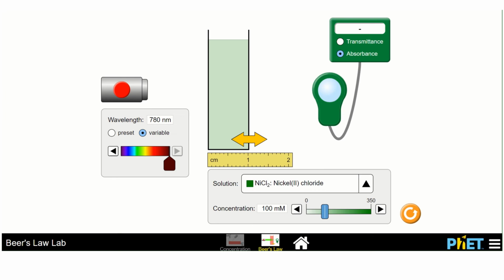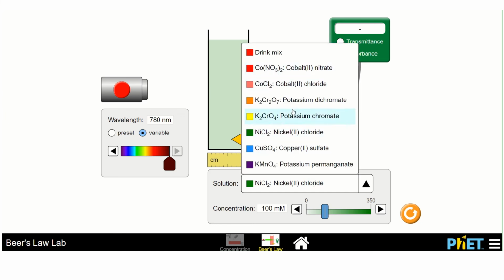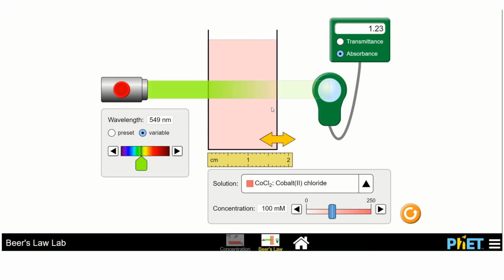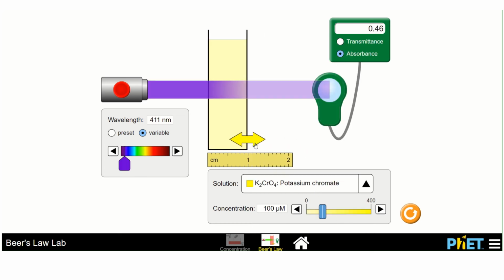So part 2, again, step number 1, I'm kind of just trying to guide you in and, you know, explain how we're working with concentration now on top of everything else, right? So you can play around with it. You can choose different solutions, change the width, see how that changes, you know, the absorbance, right? I'm literally just changing things around, and you can see that changing the width changes the absorbance, okay?